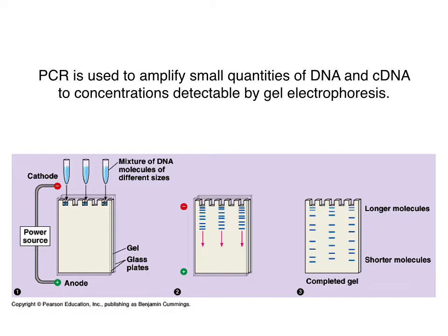The agarose is a matrix with pores which allows DNA of various sizes to run differently through the gel. Shorter molecules move faster than longer molecules, and thus the DNA can be separated. Ideally, one would look for the formation of a single band at the estimated size of the DNA fragment. PCR products can be used as a target for hybridization, for direct sequencing of the DNA, and as a specific probe. PCR has several important advantages.